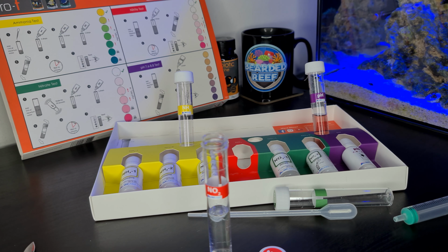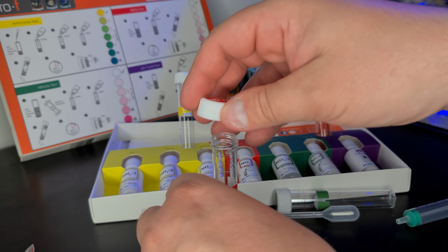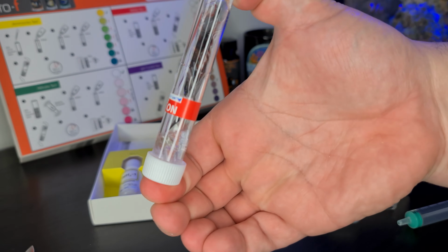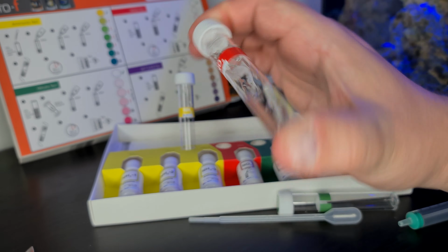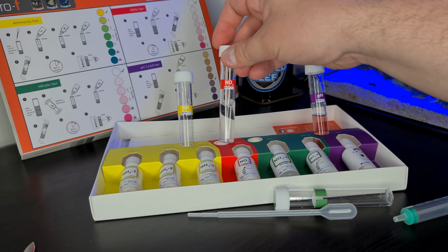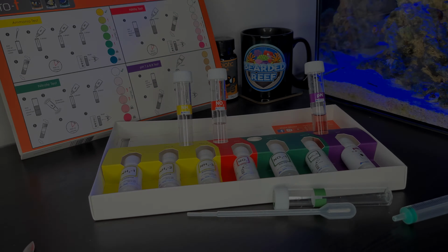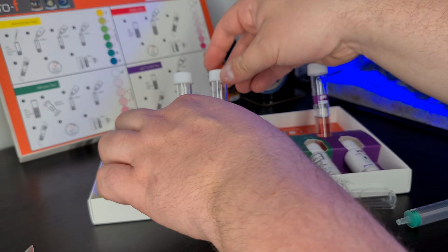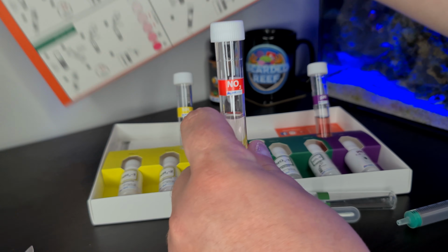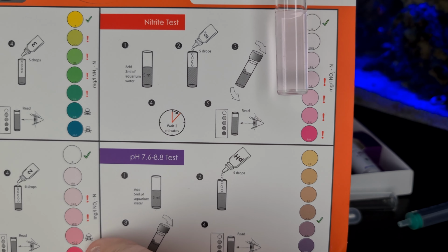Okay, it's 5 drops in that one. Put the lid on tight on this. Set that in there. Now this one, same thing, invert it a few times. This one you'll only wait 2 minutes for, so it's a bit better. So I'll sit that in there and we'll give that 2 minutes and I'll come back. Okay, so that's been 2 minutes now. I'll take this one out of here. Don't know if you can see or not, there's a slight tinge to this one, which I'm quite surprised about. But we'll have a look anyway.